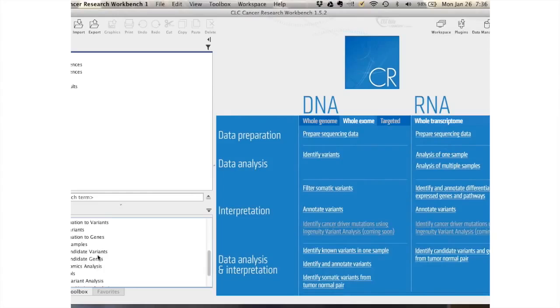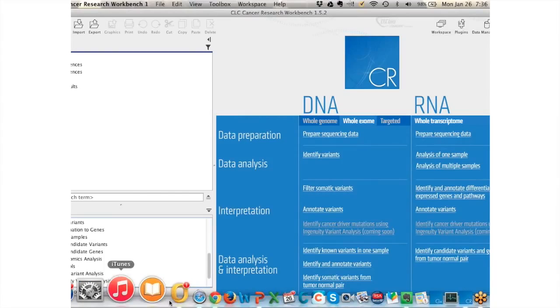If we look here, you could see that I actually have a variant analysis plugin, so I can send my sample directly to the variant analysis tool, and it will run the analysis for you. Similarly, when you are using the web platform tool that was discussed in the webinar of last week, it will also run the analysis for you.